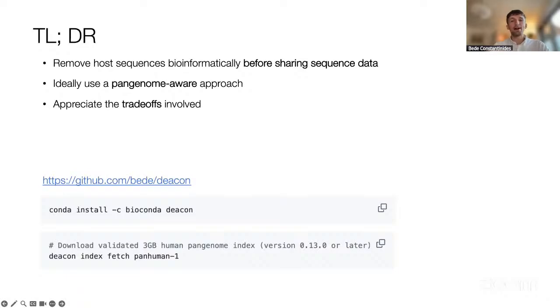While host depletion is particularly important before you share data, actually it should probably happen even before you analyze your data. And I appreciate some of you listening will already be very familiar with this topic in general, and that I'm preaching to the converted, to some extent.